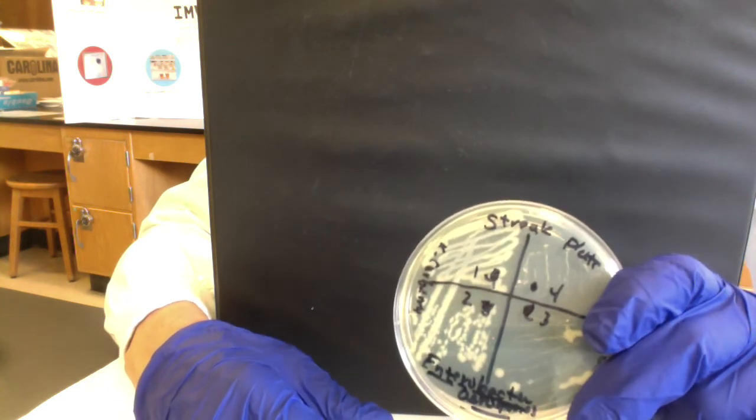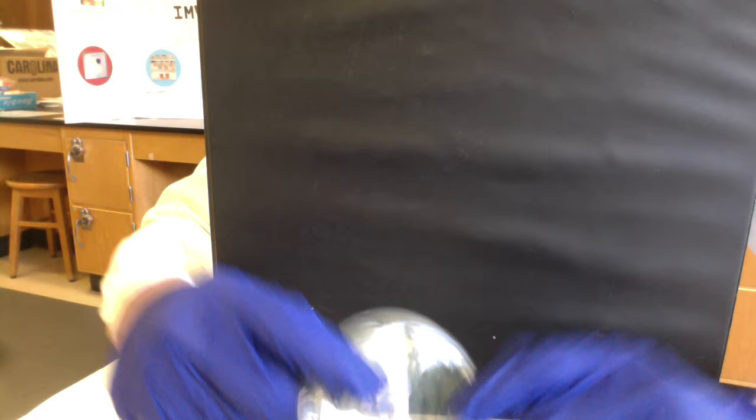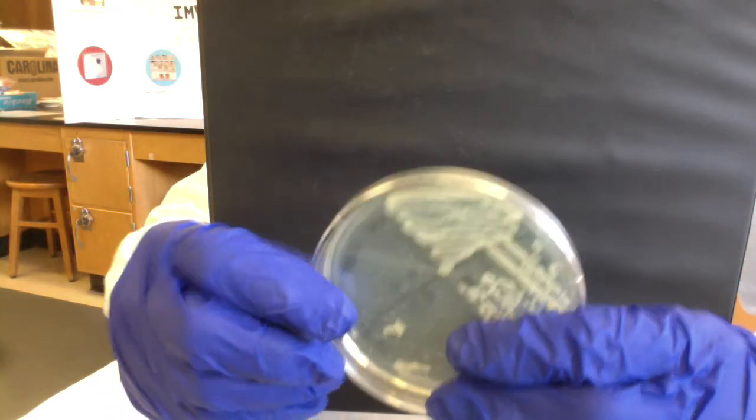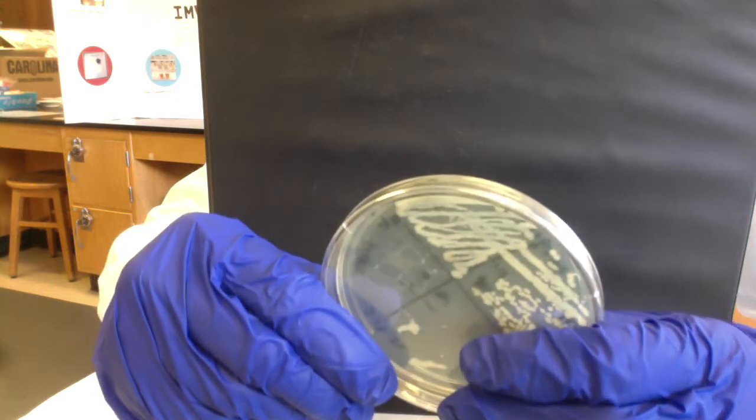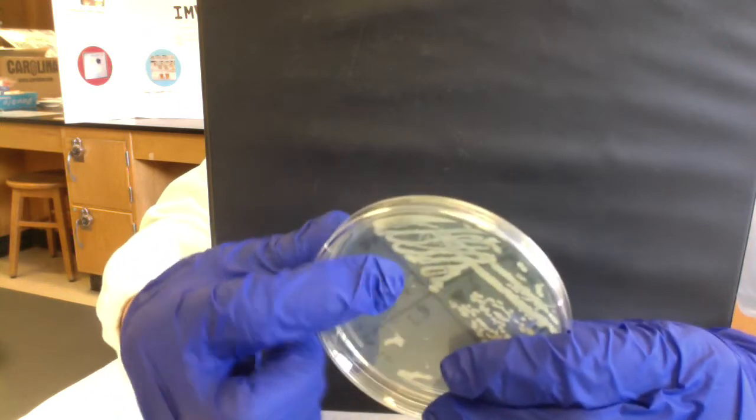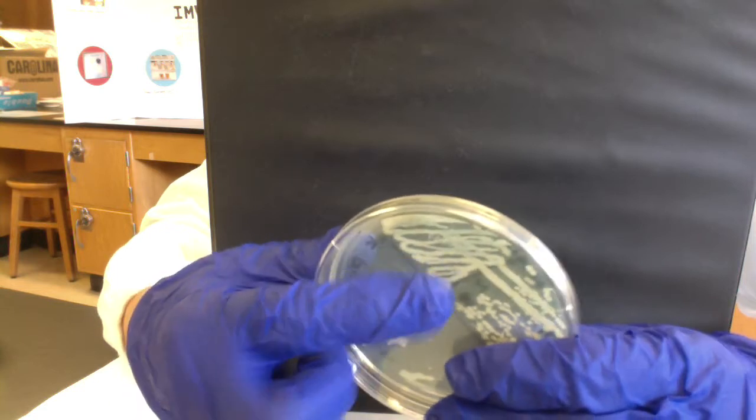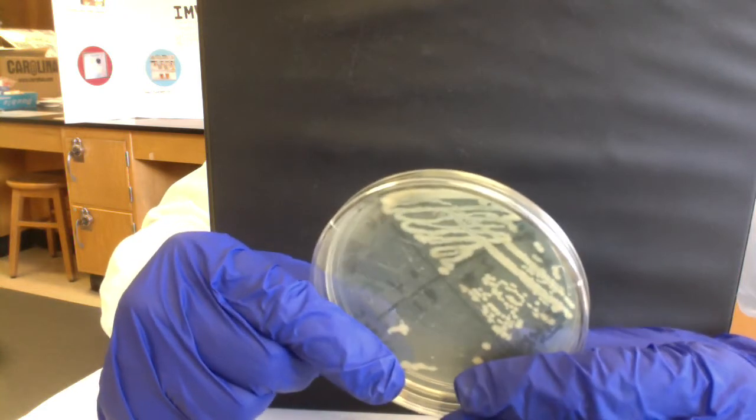When we streaked our plate, we used the four-quadrant technique. We took one loopful of broth and spread it over the surface of quadrant one. You can see there were so many bacteria present that when they grew, the colonies are touching one another, so this isn't isolated.